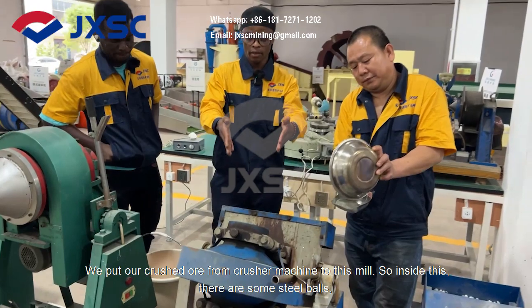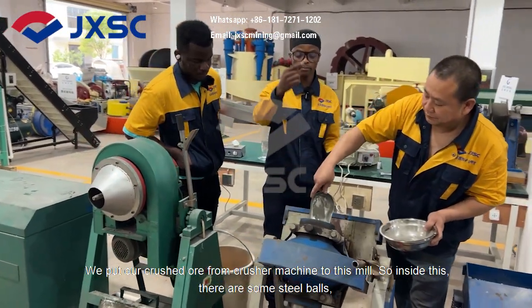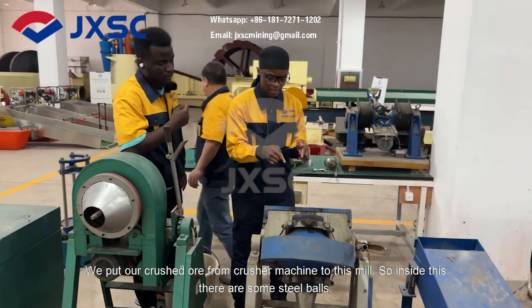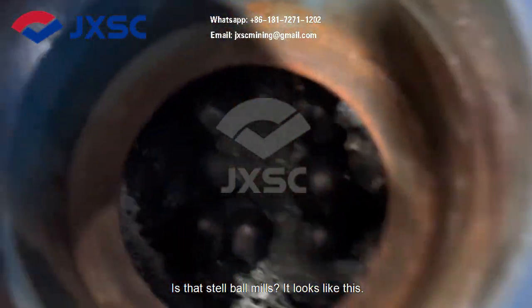So actually, we pour our crushed ore from the crushing machine through this feed. So inside this, there are some steel balls — these are steel balls, it looks like this.